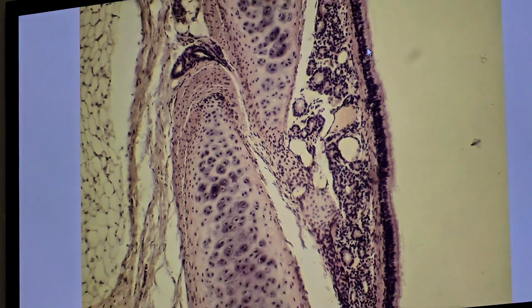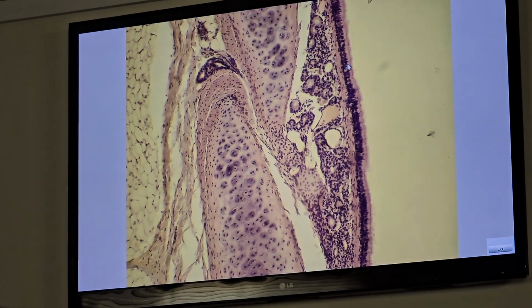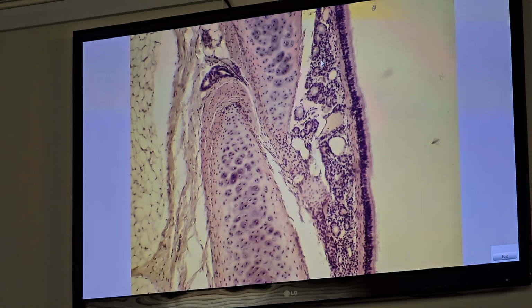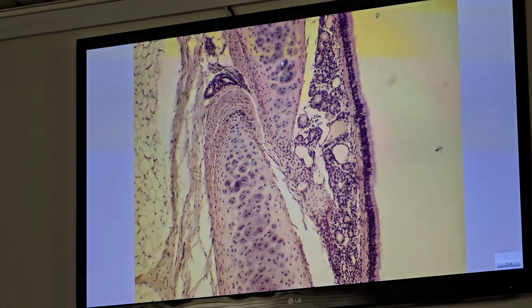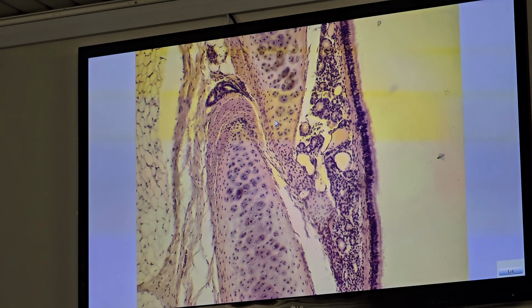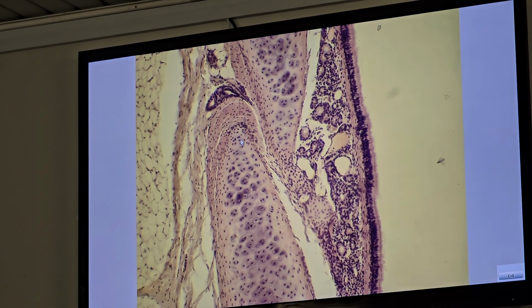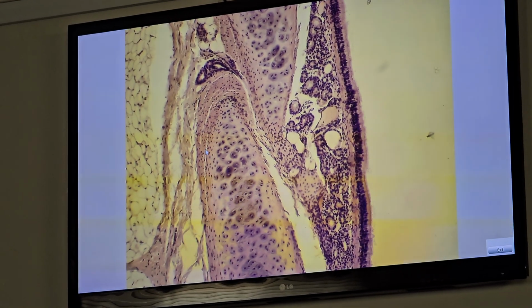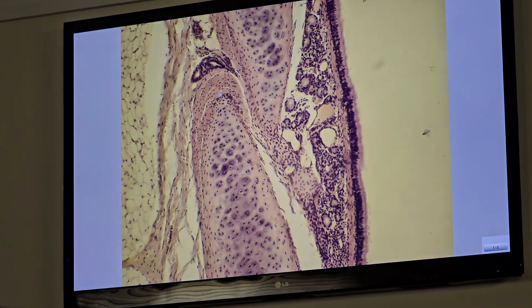Ciliated pseudostratified columnar epithelium, lamina propria with mucous glands, hyaline cartilage ring, the open ends connected by trachealis muscle and a sheet of fibroelastic tissue.